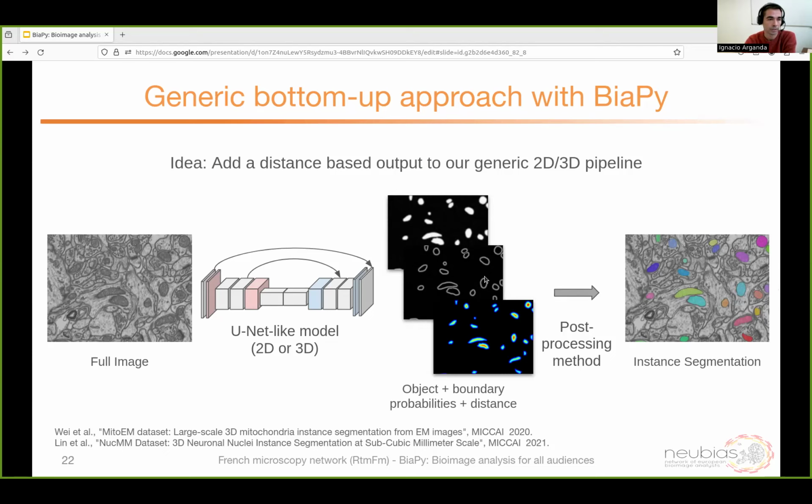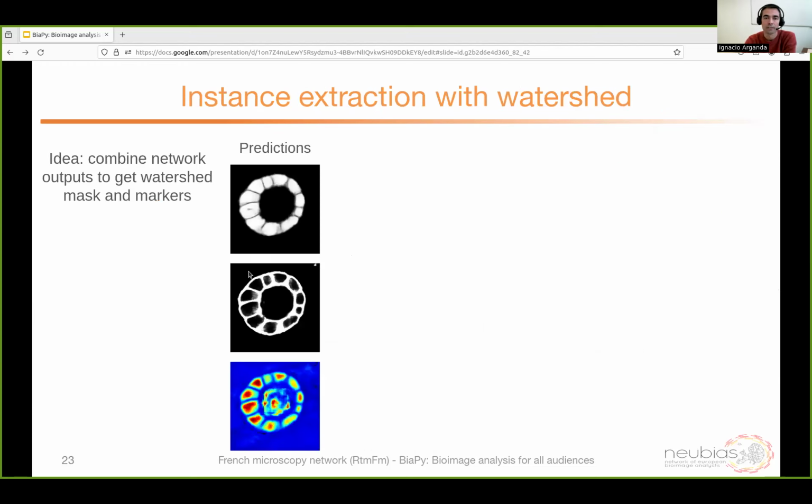And how do we do this? Well, we can use our good old friend Watershed. We have other options there. So we can combine the outputs into a single instance image. Let's see this example. These are slices from a 3D result, and we're trying to identify these cells here. One output channel will be the probability maps of every cell, which, as you see, is not perfect.